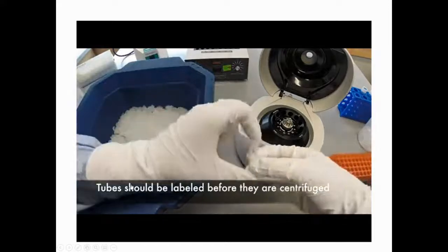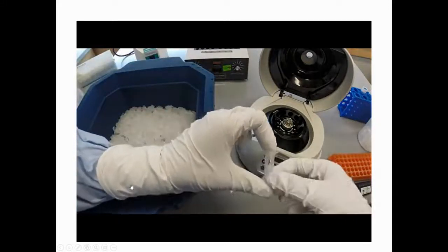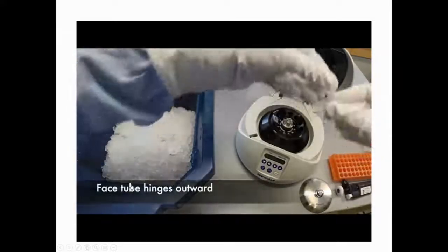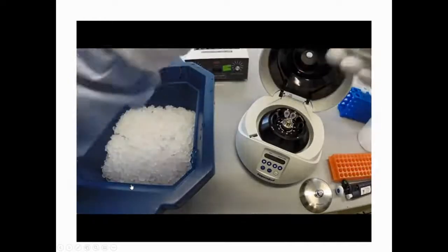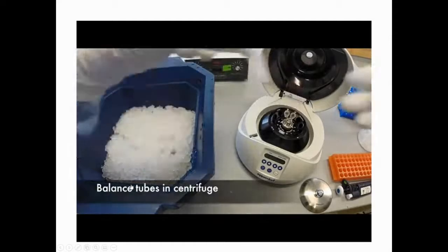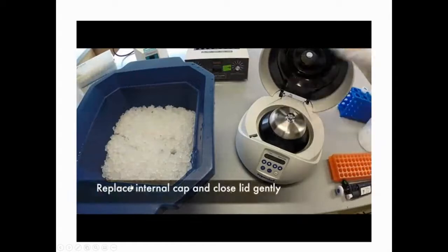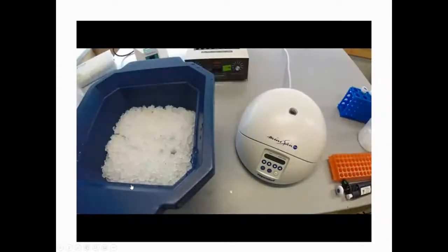Make sure that the tubes are labeled either with letters or numbers before loading them into the centrifuge. Load samples with hinges facing outward. That's very important. The hinge faces outward so that all the precipitate will be in a certain direction. Have equal volumes. Replace the metal lid and press it until it clicks securely onto the rotor. Close the lid to the microcentrifuge gently.